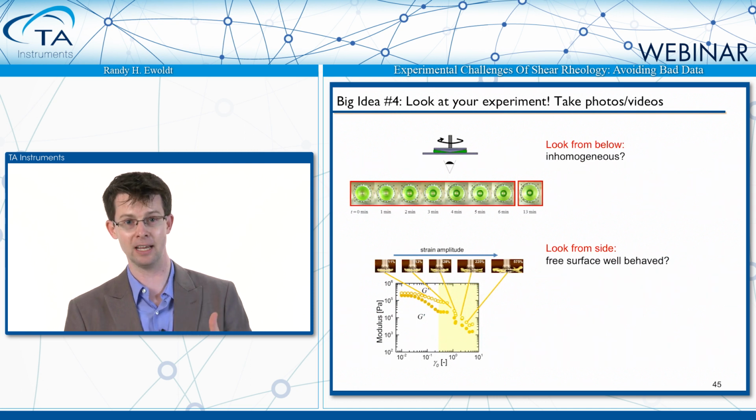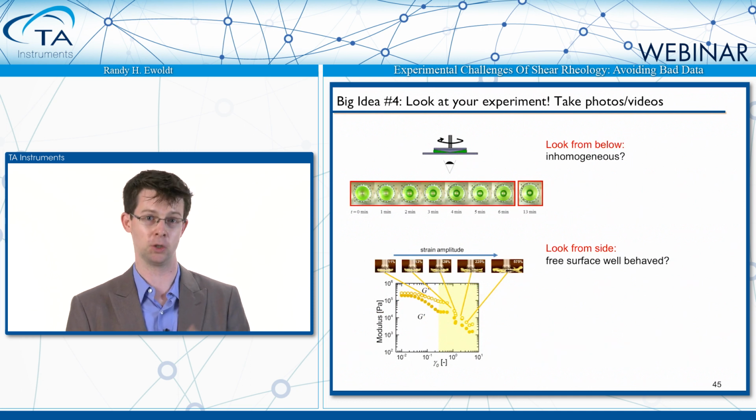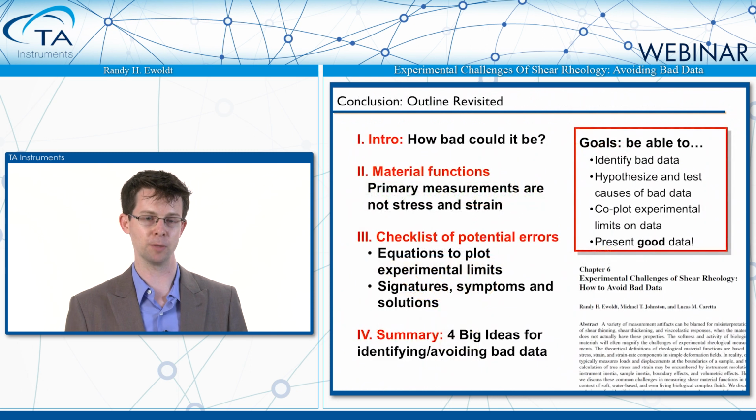Finally, look at your experiments, and find some ways to encourage yourself or the people making measurements for you to take photos and to take videos. If nothing else, it accelerates your communication. Even when the experiment is going well, you can maybe demonstrate and show what it is that's going well and how the material is responding.